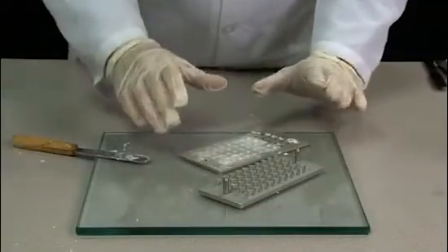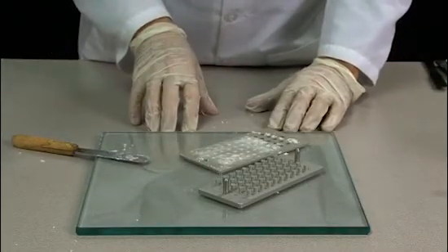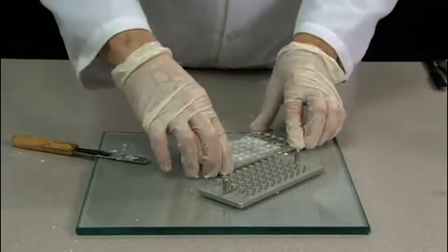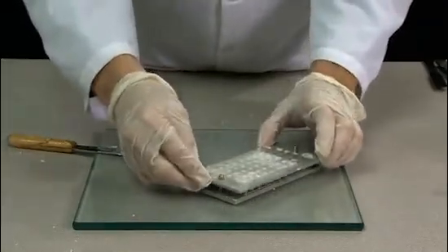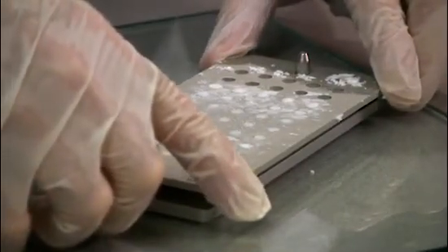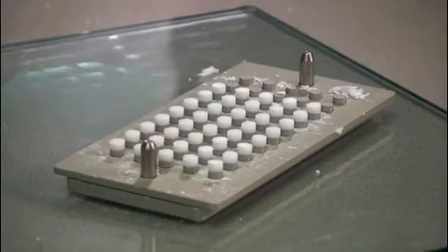When you're ready to move the cavity plate to the peg plate, it's best to slide the plate off of the pill tile instead of raising it up. Slide the plate off, put it onto the peg plate, and push down gently. The tablets will stay on top of the pegs, but will be pushed out of the cavity plate.